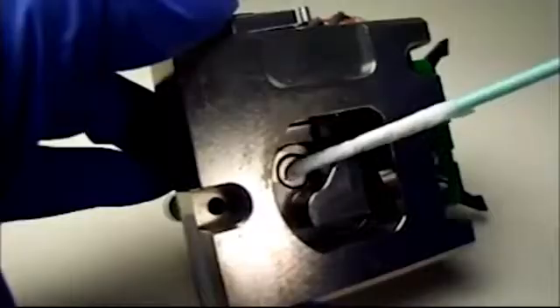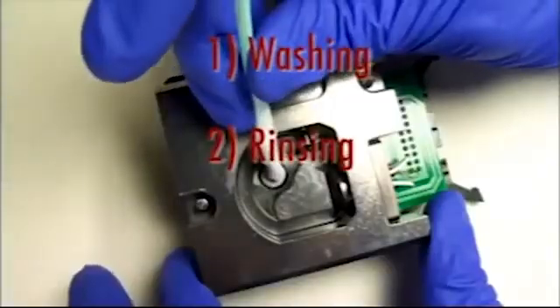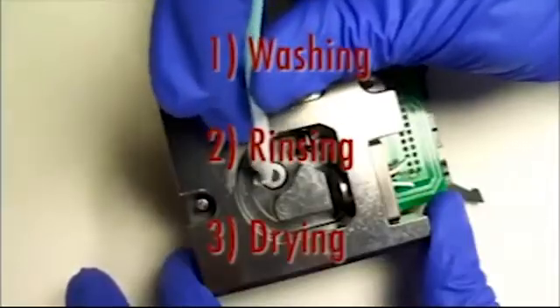The cleaning procedure consists of three important steps: washing with isopropyl alcohol, rinsing with distilled water, and wiping dry.